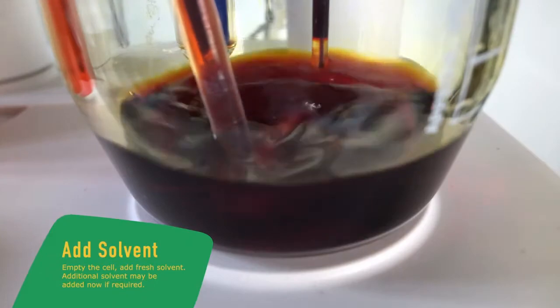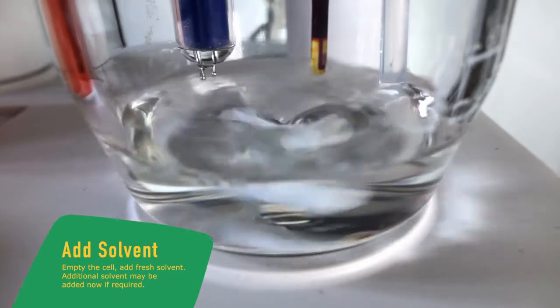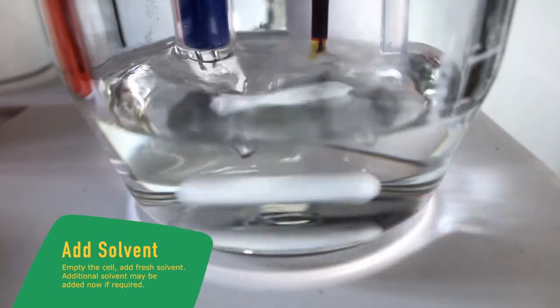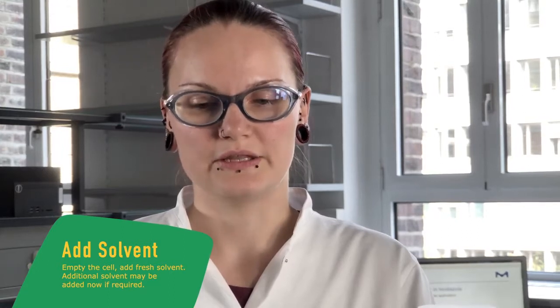Now we empty the cell and add fresh solvent. If additional solvent is needed for the determination, add it now and then perform the pre-titration in the solvent mixture.